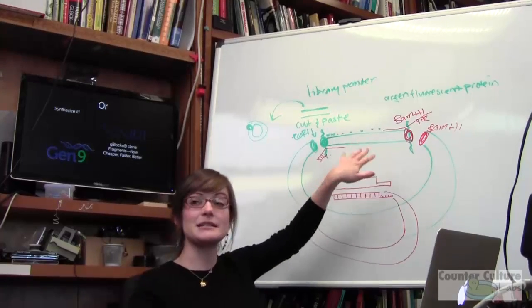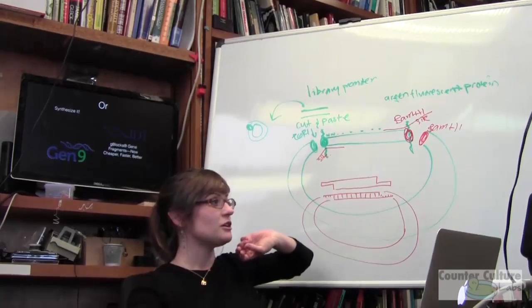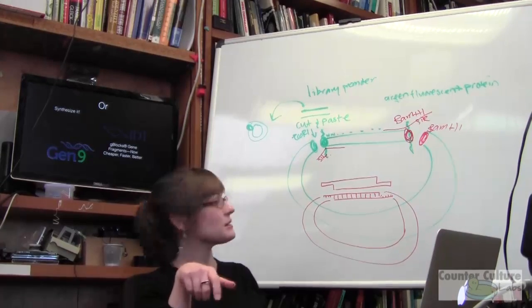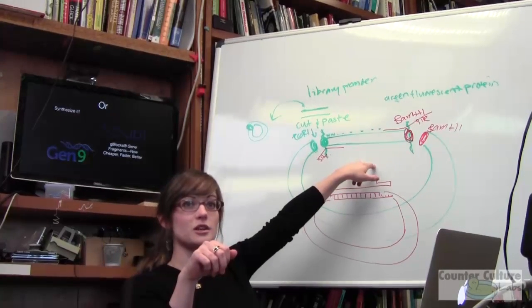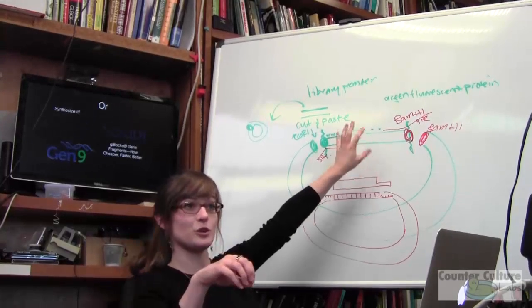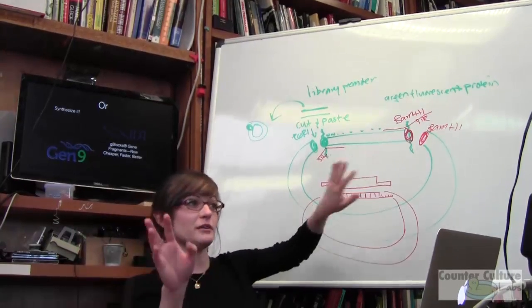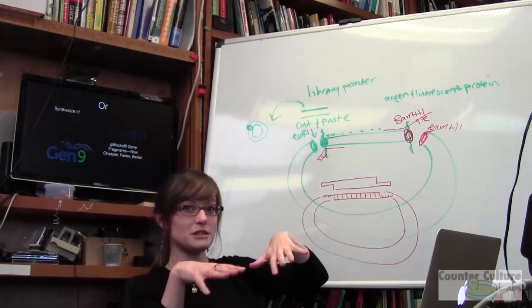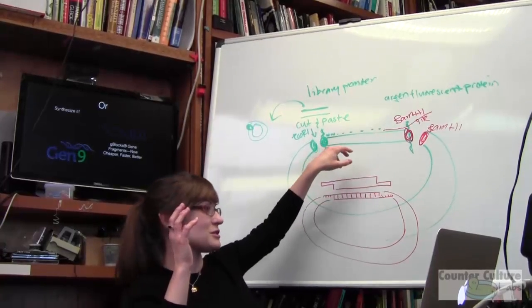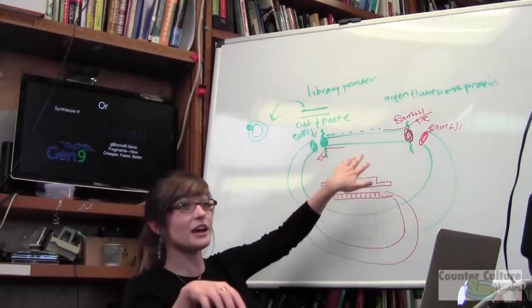The great thing about getting something synthesized is that if you know the final protein sequence that you want, because of the wobble codons, since there are multiple codons for each amino acid, you can alter the nucleotide sequence such that there are no restriction enzyme sites present for the enzymes you are going to be cloning with, but you never change the amino acid sequence. Now these software programs exist where you can throw in your protein sequence and convert it back to DNA, and there are ways to change the sequence such that a certain restriction enzyme site isn't present while keeping the protein sequence. So that could be a fun software project.